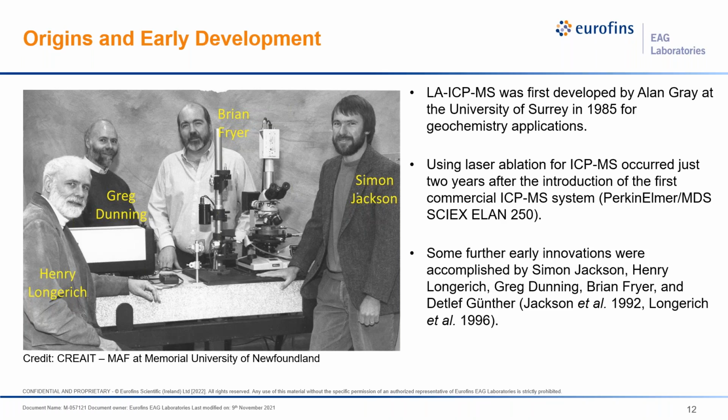Some further notable early innovations were accomplished by Simon Jackson, Henry Longerich, Greg Dunning, Brian Fryer, and Detlef Günther, of which 4 of the 5 are pictured at left. And much of this work was done at Memorial University of Newfoundland in Canada. Now, I mentioned MUN for 2 reasons. First, Canada historically has had a rather strong mining sector and consequently invested in geoscience education and innovation, which in part explains the concentration of early laser ablation expertise at a Canadian university.